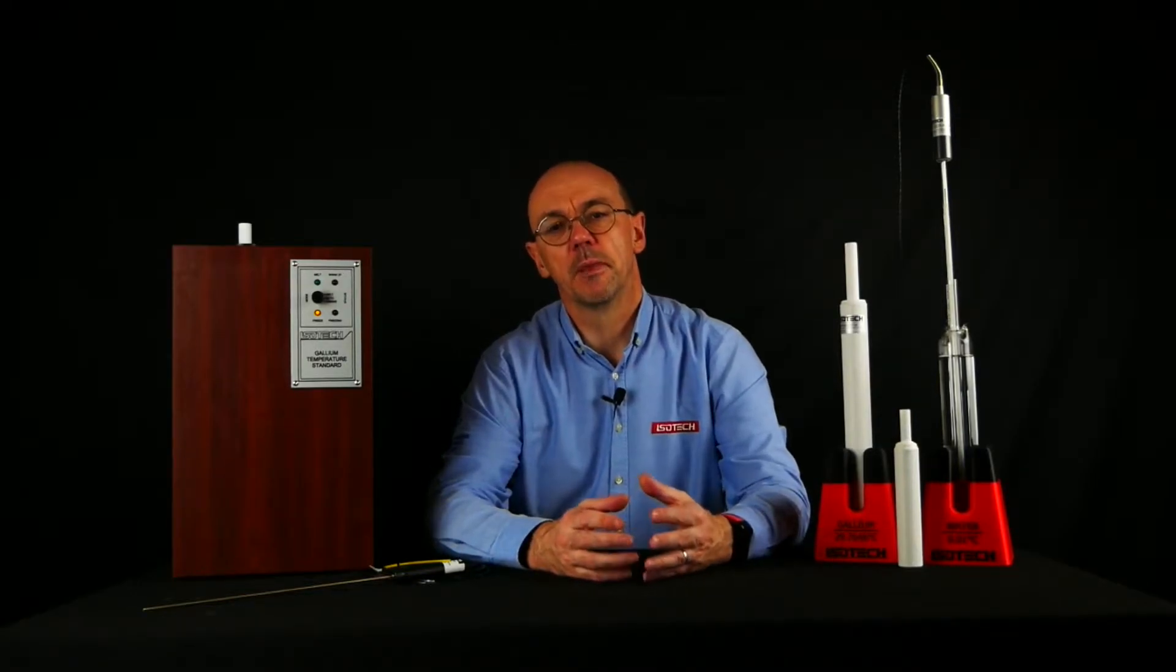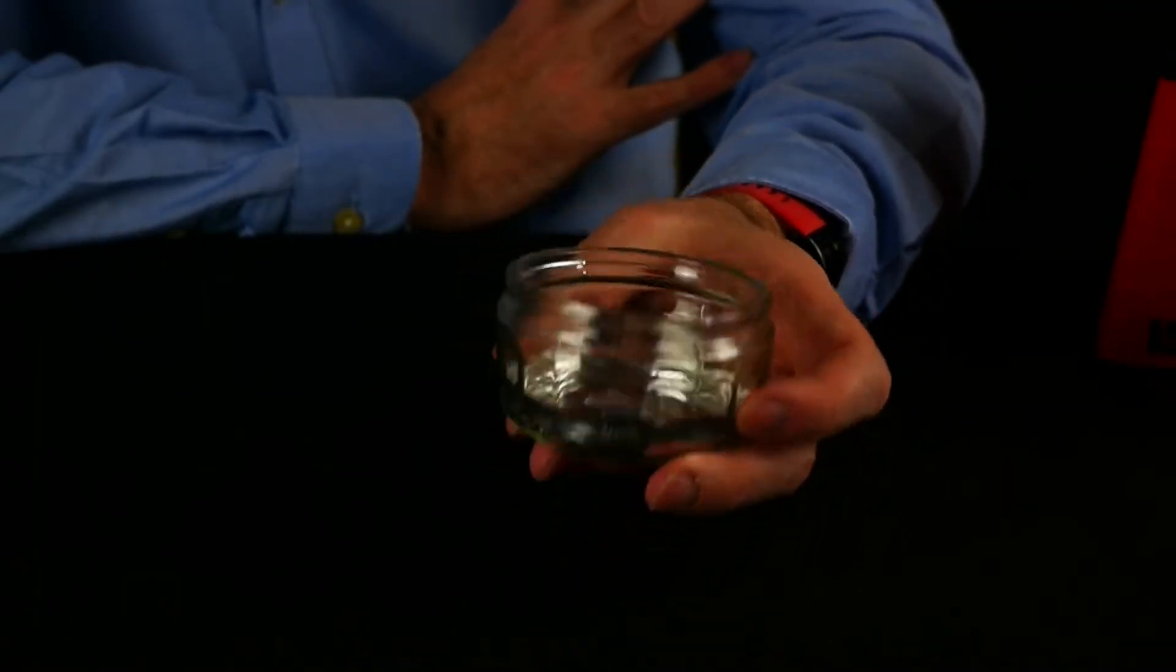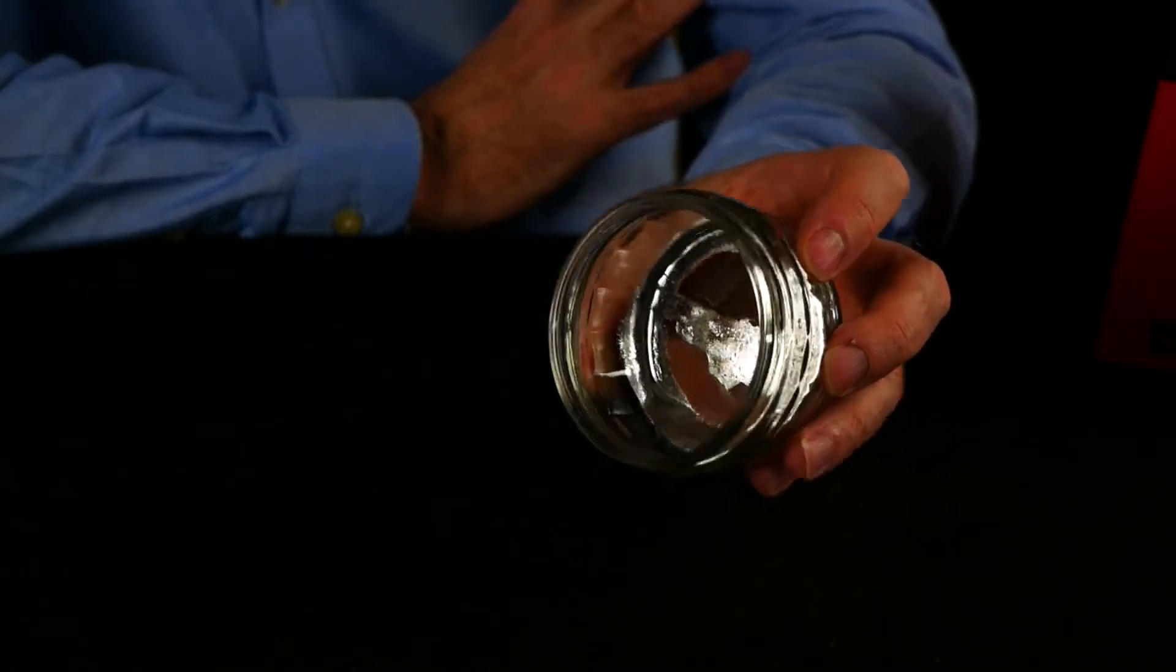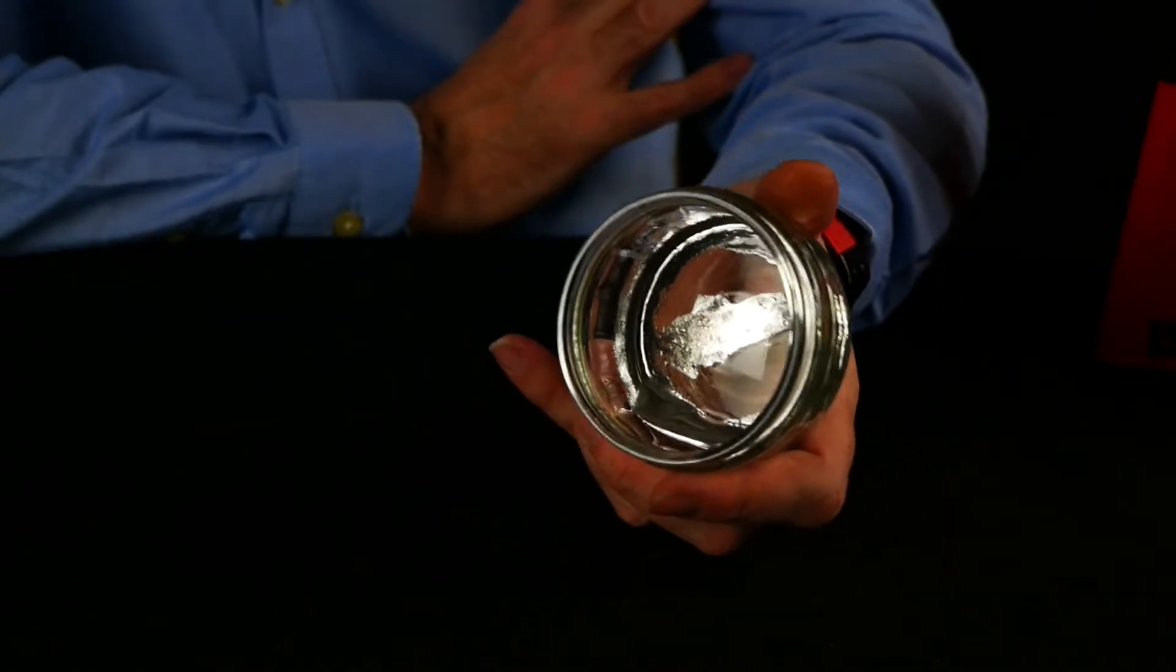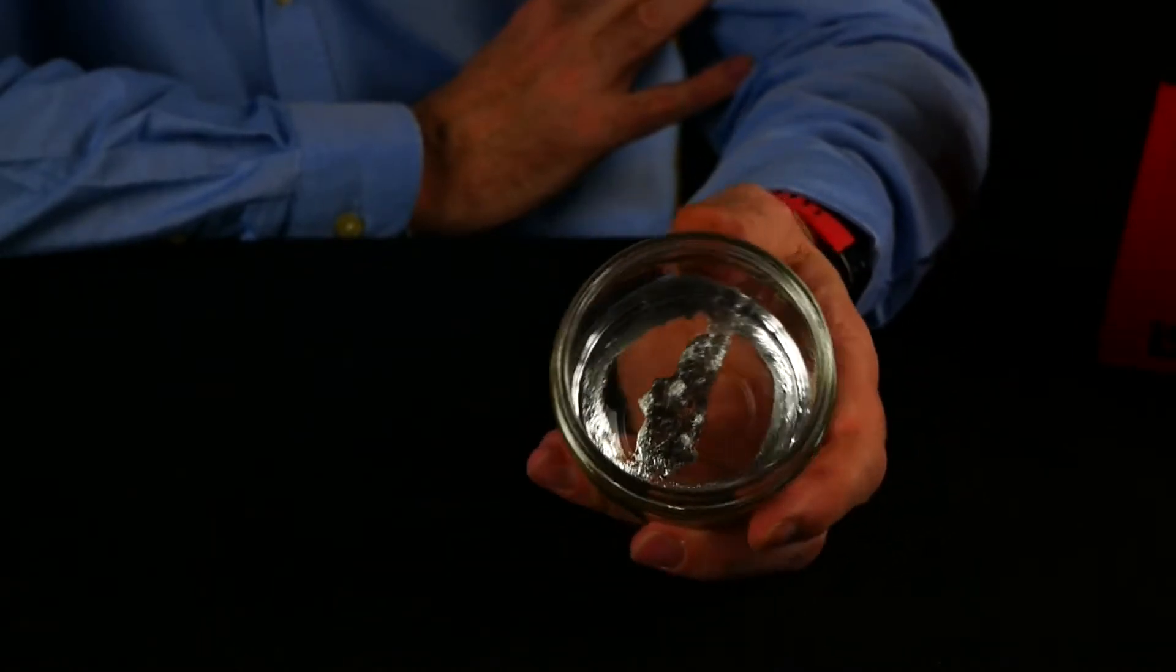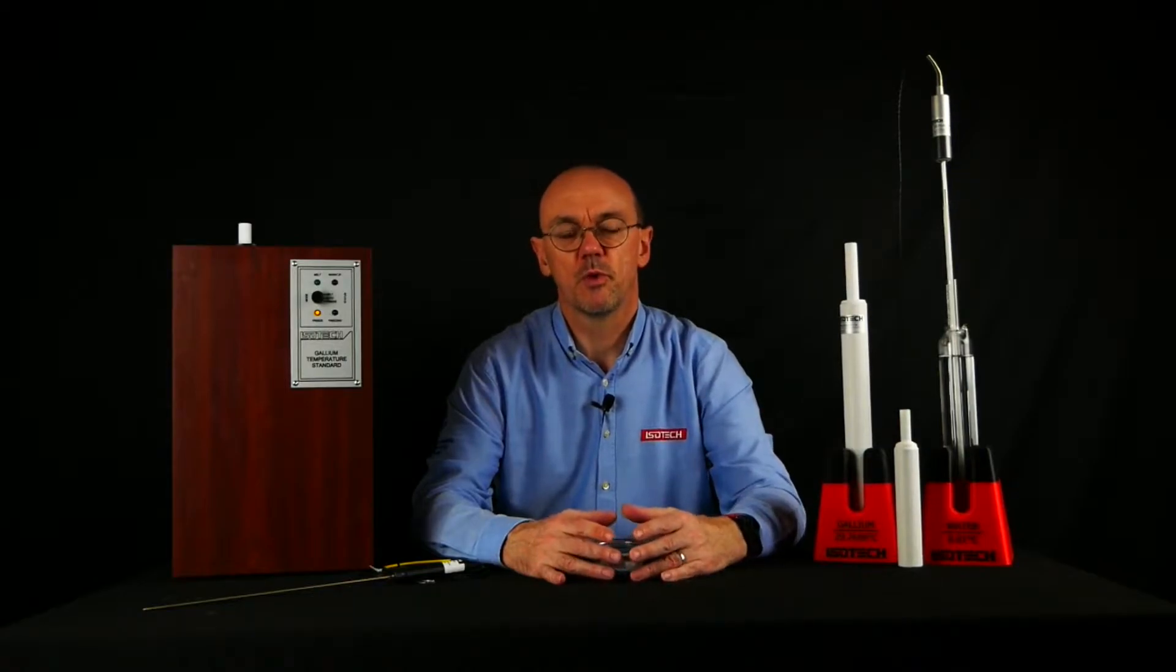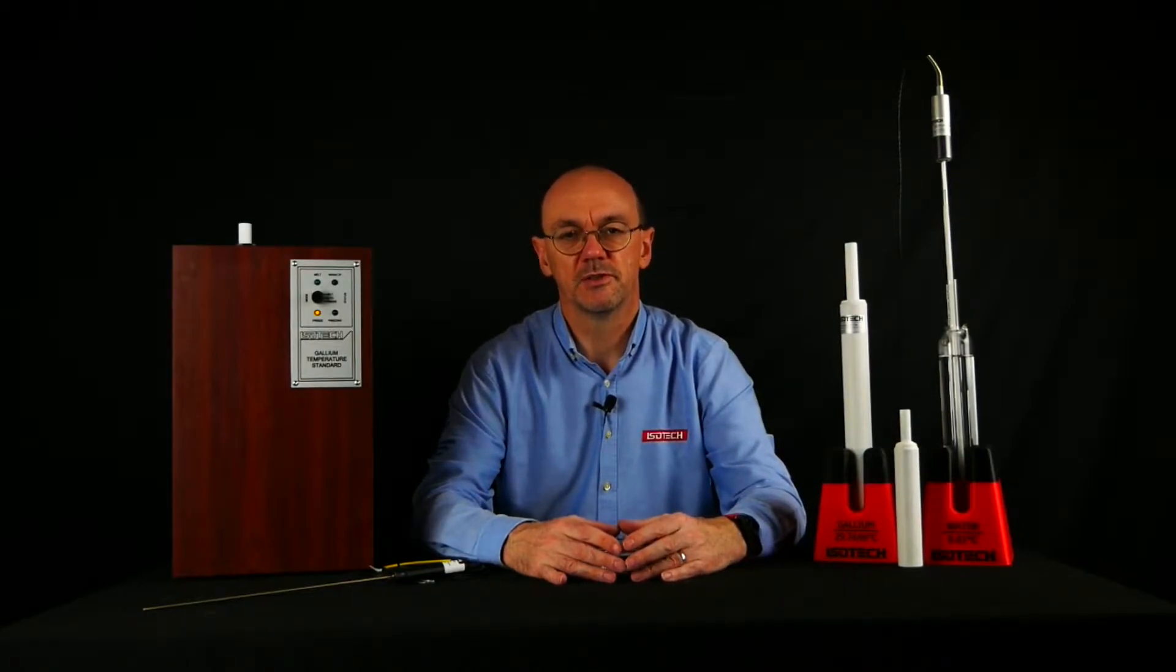Gallium is a metal with a low melting point. It melts at 29.7646 degrees Celsius. Here I've got some gallium which is in the liquid phase. Gallium is fairly easy to obtain at high purity and it's used in the semiconductor industry. It's also one of the defining points on the International Temperature Scale of 1990, ITS-90.